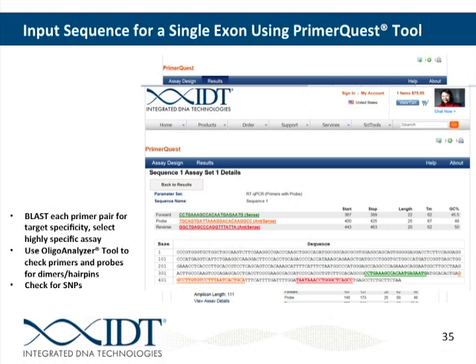And so really any of the assays would work for this application. You just want to select the assay that's most highly specific and has the best primer and probe in terms of not having any secondary structure or dimer possibilities.